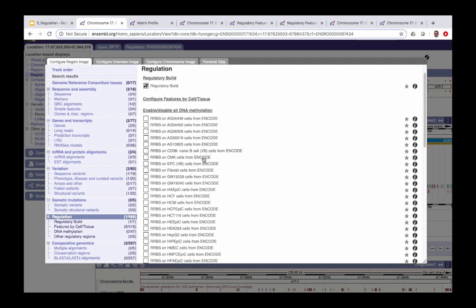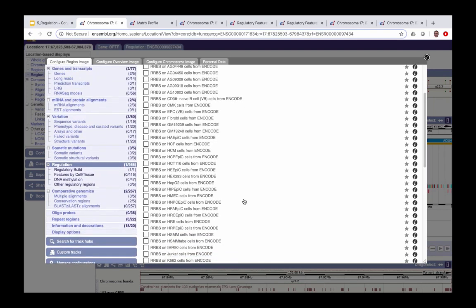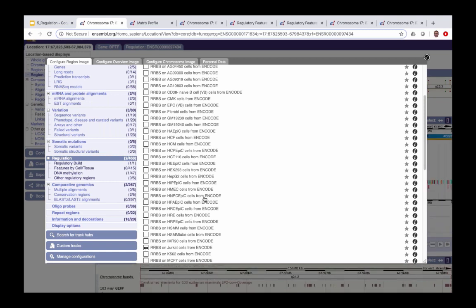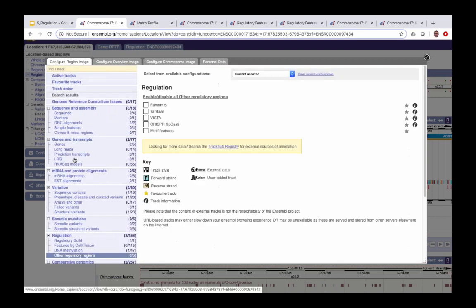There's also DNA methylation data from ENCODE — several cell types have reduced representation bisulfite sequencing (RRBS) data available. I'm going to turn on the methylation track for HeLa-S3 cells by clicking the box. From the 'Other regulatory regions' menu there are additional data types: FANTOM5, Tarbase, Vista elements, motif features, and also the CRISPR-SpCas9 track.